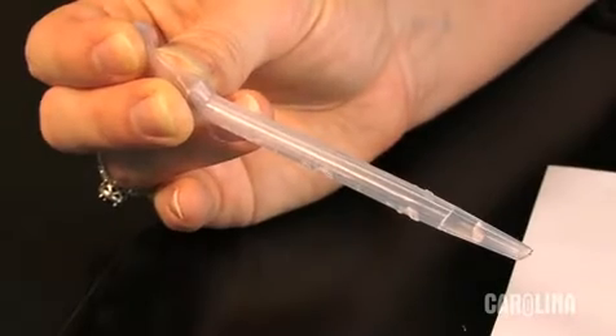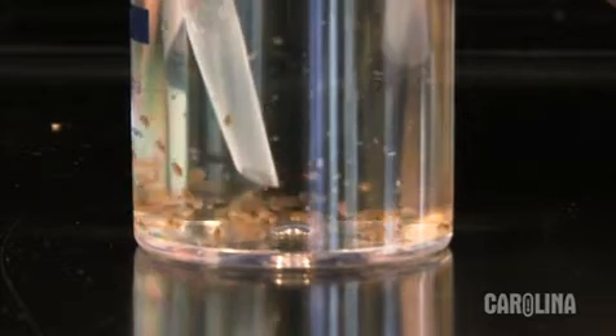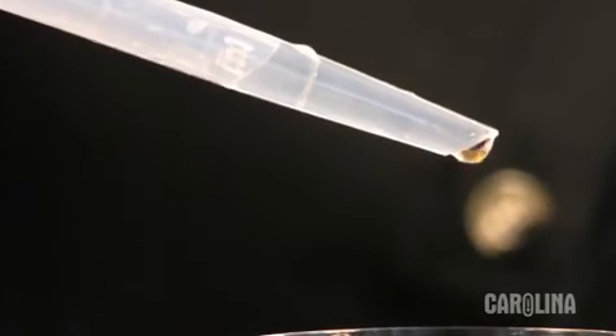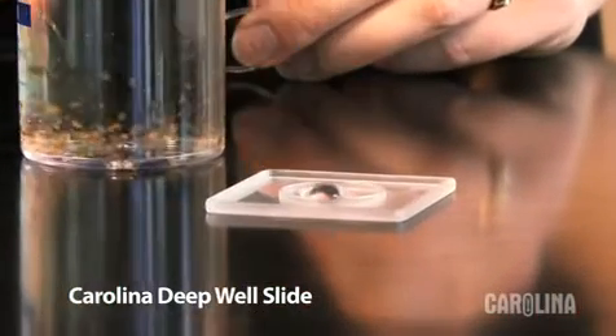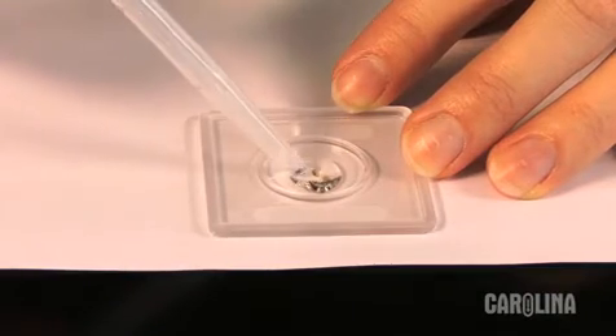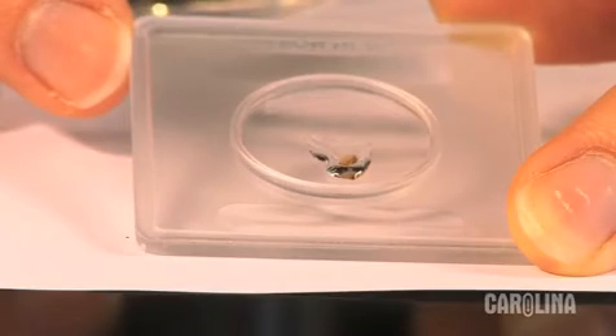Squeeze the pipette bulb and place it in the culture water. Gently and slowly release the bulb to draw a Daphnia into the pipette. Once you have captured a Daphnia, transfer it to a slide. I am using a Carolina deep well slide, which works really well with Daphnia. Use your pipette to remove some of the excess water until the Daphnia can no longer swim freely.